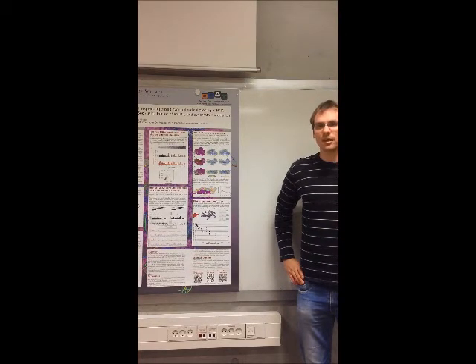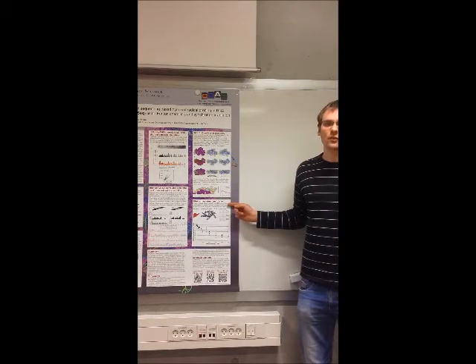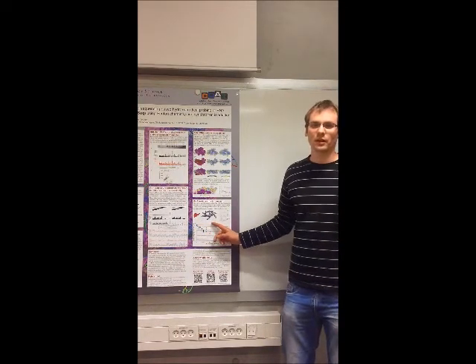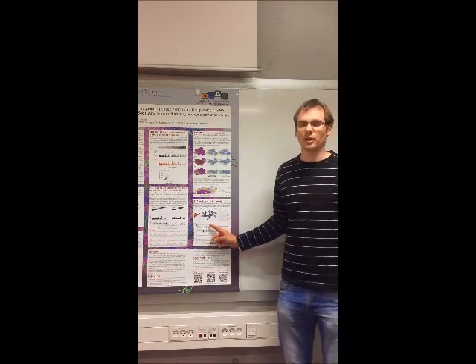As a next step, we aim to probe the RNA accessibility in vivo. We have irradiated pieces of mouse liver with synchrotron-generated X-rays, known to form hydroxyl radicals in the cytoplasm, which are able to probe the RNA backbone accessibility.